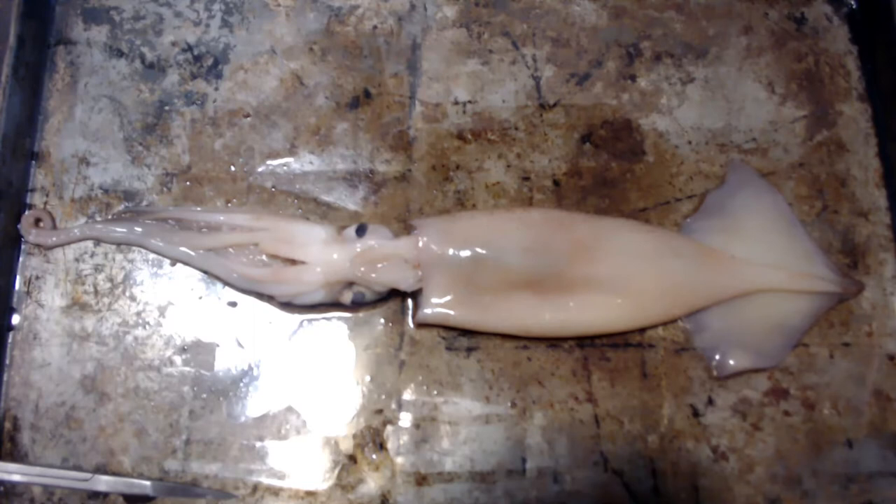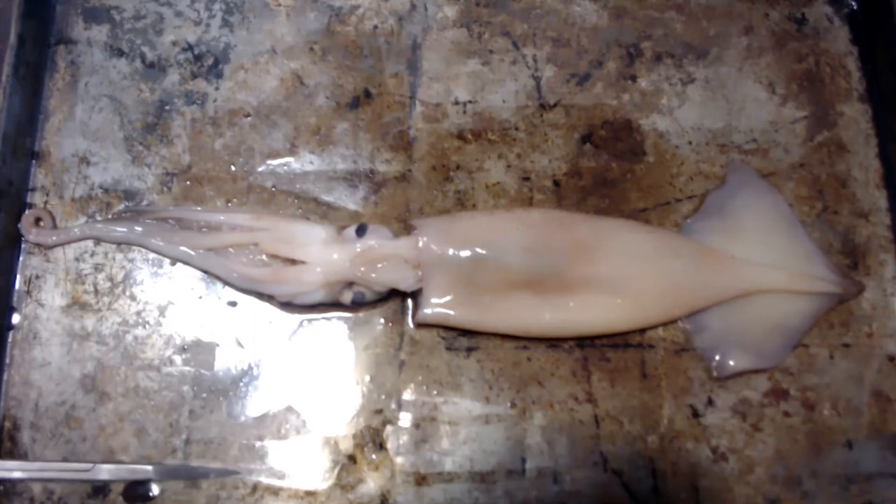So I threw all the squid away before that, thinking this was going to be a good video, but there was just so much glare. I didn't have any squid for that week and the whole weekend. My parents actually found some squid at Big Y near us, which is really cool. These are local squids, so I'm more familiar with dissecting these, unlike the ones from California. This squid is actually a lot meatier and bigger. So let's get into the video.